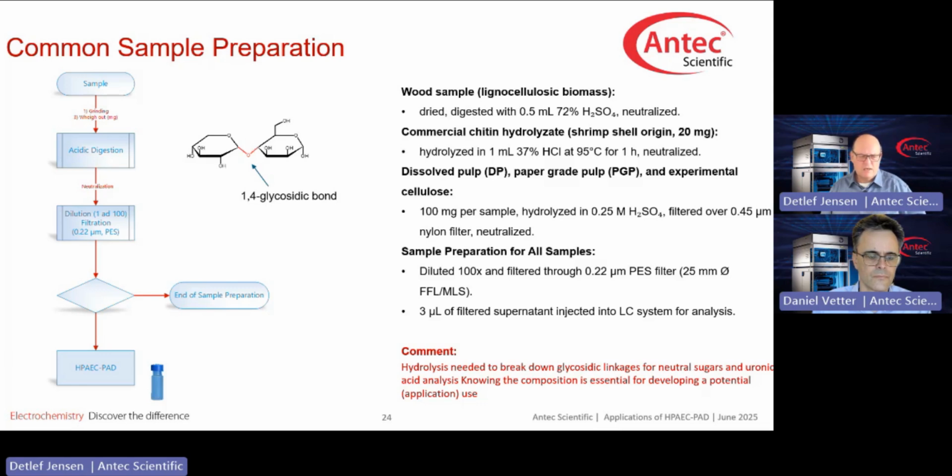So my suggestion is to basically look into existing applications and existing articles and take the sample preparation from there, because that will allow you to create comparable data. And you find many of these sample preparations described in great detail in our application notes.